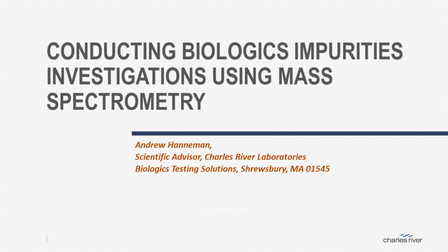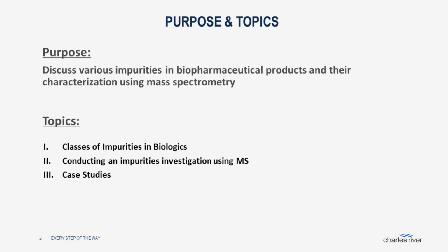Let's all hope. So I will be discussing conducting biologics impurities investigations using mass spectrometry. I'm with Charles River Laboratories. My background is in analytical chemistry and specifically mass spectrometry. Our facility is located just west of Boston, in Shrewsbury, Massachusetts.